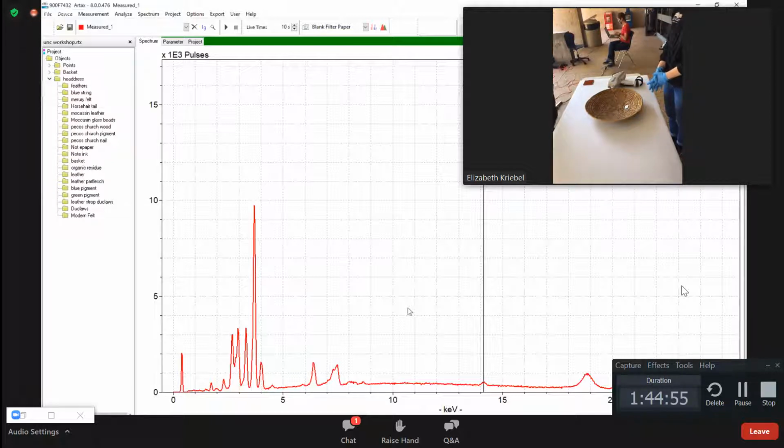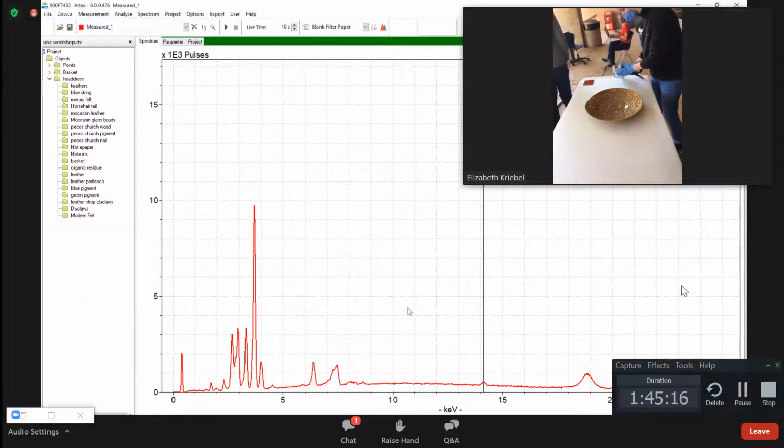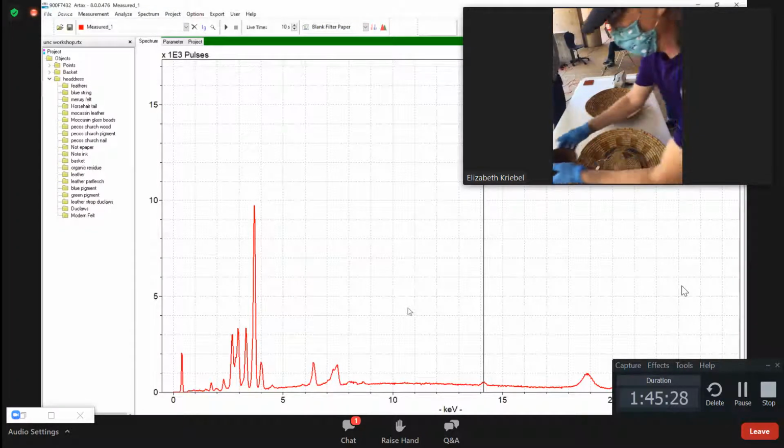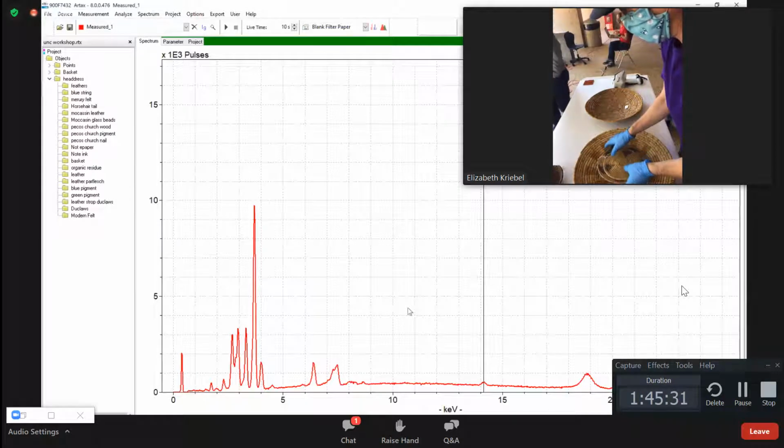We're going to screen through these baskets because they're pretty cut and dry. Is it okay if I tilt it up just to see? Yeah, absolutely. So we're measuring right there. That little circle is the eye, that's the detector. They cost $9,000 to make, and when they break, they make a loud popping sound. Well, I'll keep an ear out for that. In that moment, you slip out the back and then come in and go, hey, who's been messing with my thing here?